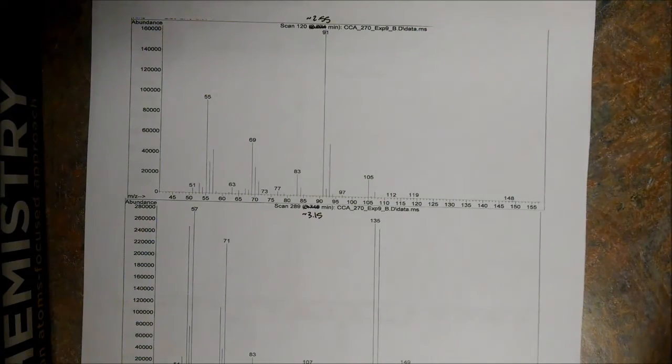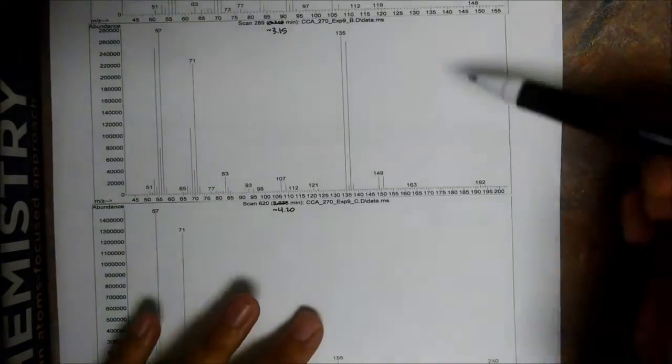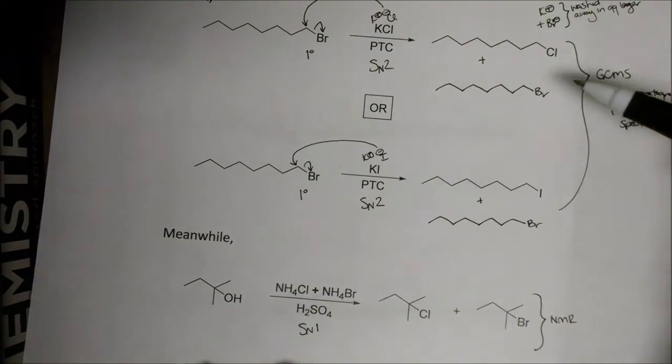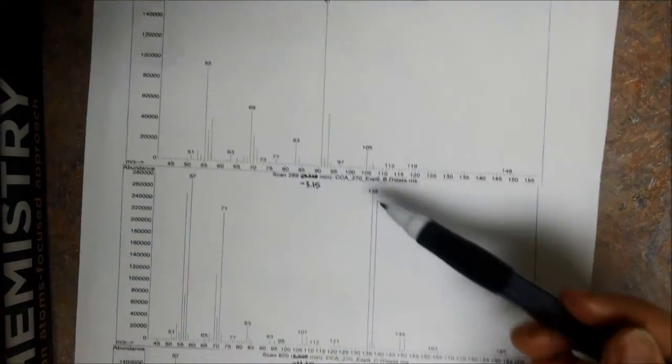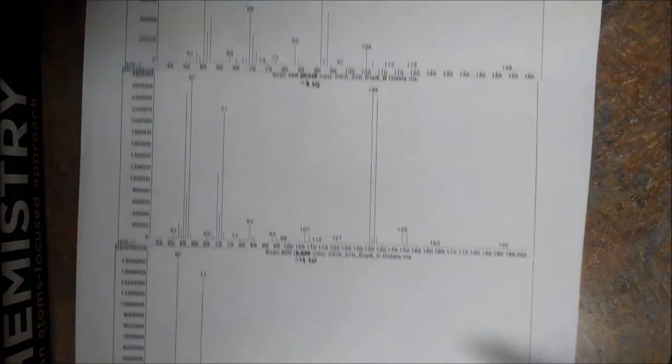Okay, here they are. So can we figure out which spectrum corresponds to which compound? Okay, which of these compounds? Again, that's all that's going to be in here: the chloride, the bromide, or the iodide. Okay, yes, we can figure out by looking at the ions. Notice here we have a 3:1, a 1:1 ratio looking there. Hopefully there's a 127 in here.